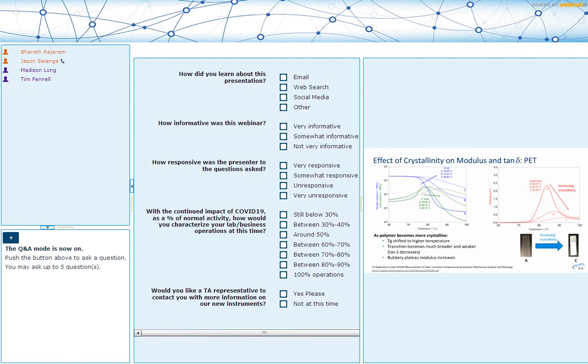So it fails when you have a big difference in glass transition of these individual components. The larger that difference, the greater the likelihood that it will fail. It has been seen to work in some cases where the delta between these two is as high as about 50 degrees, but one must exercise caution in using TTS.